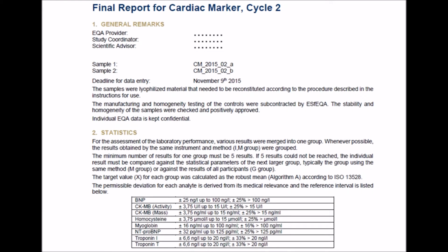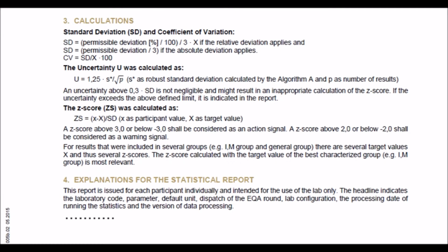The second report is laboratory specific. It shows the lab performance for an EQA and round. This report is divided into three parts. The first one is an optional PDF file written by the coordinator containing information about how the statistics have been done. It may contain general comments on how some peer groups performed and so on. This file is merged with the main report as a header.